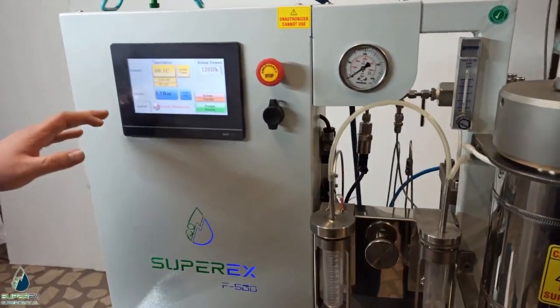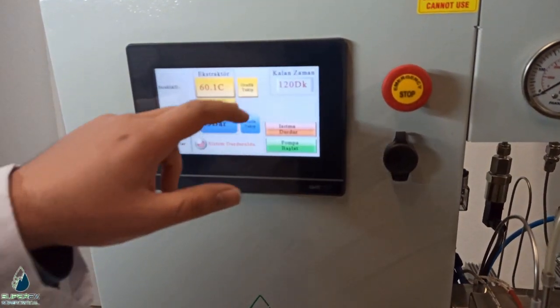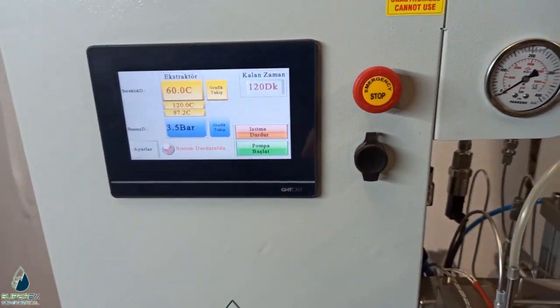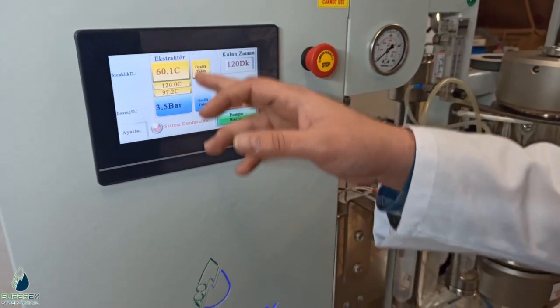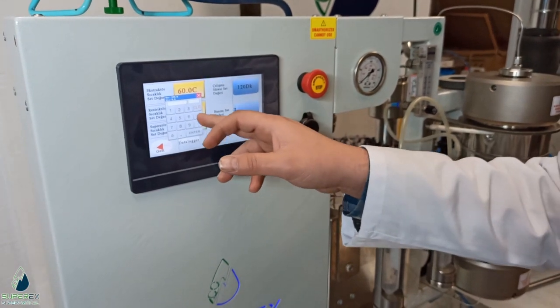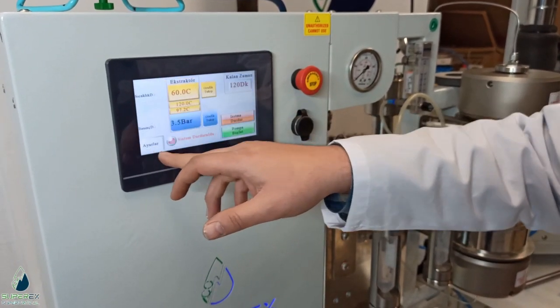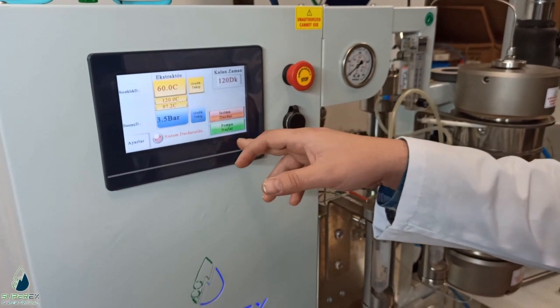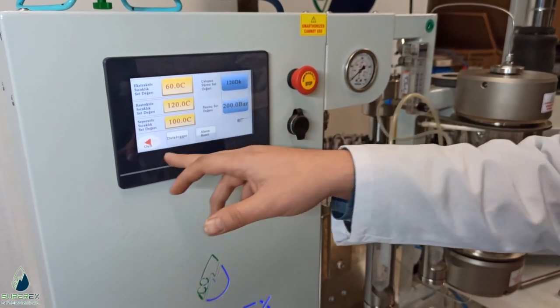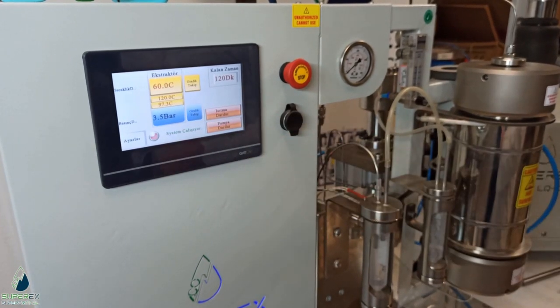The extraction vessel is preheated to 60°C. The restriction and separation temperatures are visible here. We applied some updates to the program software to display pressure and temperature on a graph. Now we can start the process to pressurize the R134a to 200 bar. I can start the pump now.